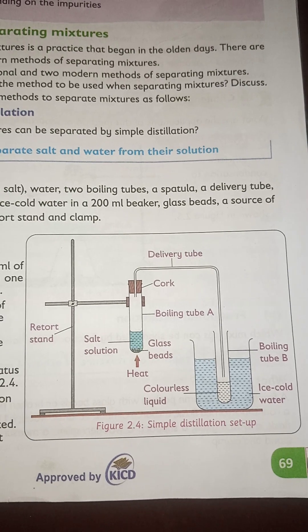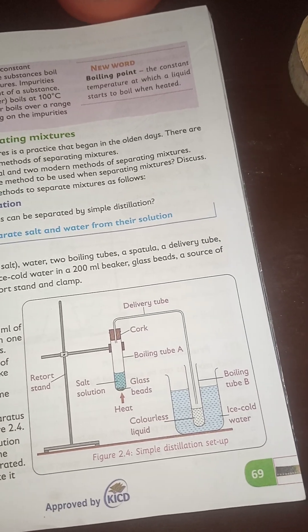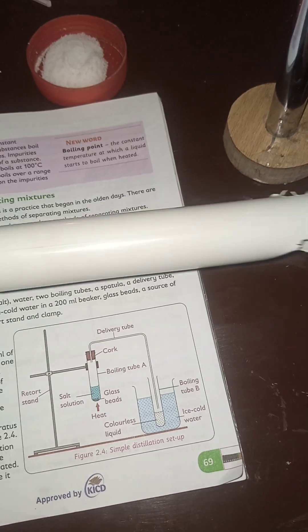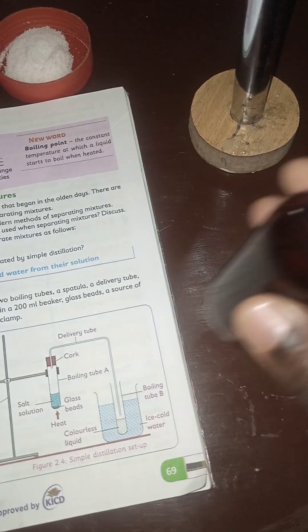From this particular illustration as drawn here, we have come up with this one as our retort stand. Next we have an arm that is linking the retort stand to the glass tube. This one is going to be our arm from our locally available material, linking the retort stand to the glass material. Then we are going to use this glass bottle, formerly used for medication purposes, as our glass tube.